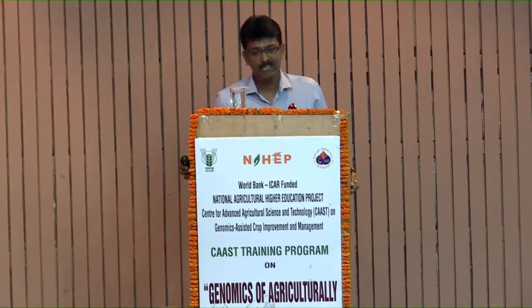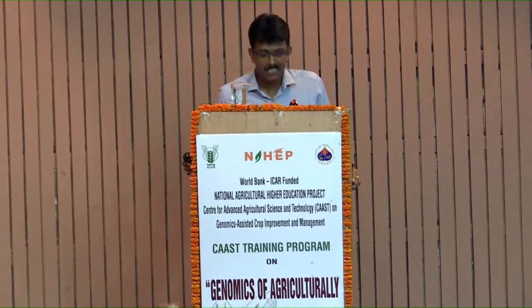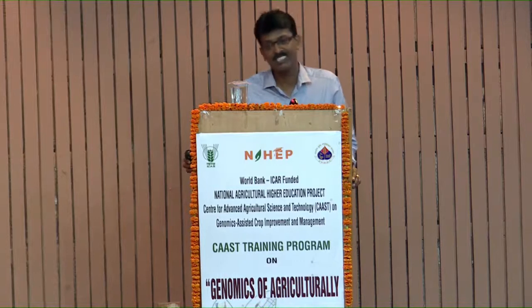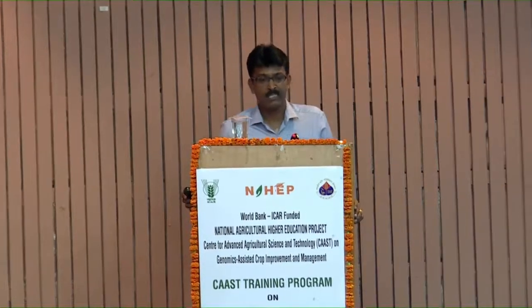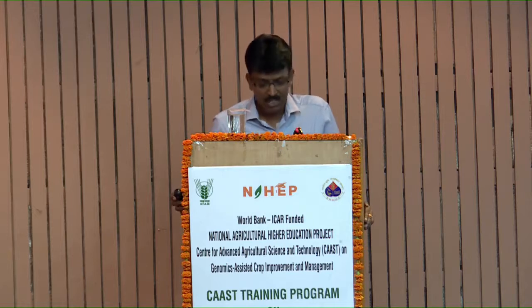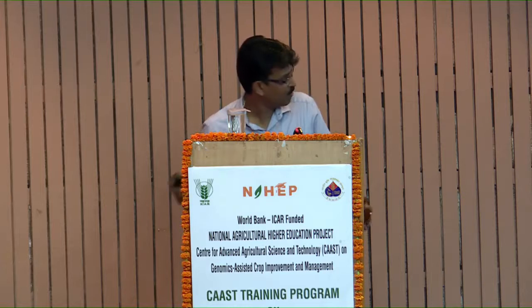Students, I would like to really tell you about the fundamental differences between PCR and Qpcr. In Qpcr, we have quite a lot of variants, and I would like to tell you how exactly they are differing from each other. The highlight of this particular lecture would be on how to visualize the results of Qpcr data. That's very, very important.